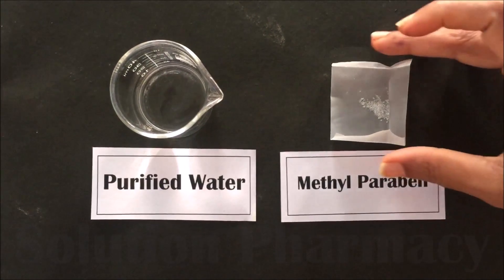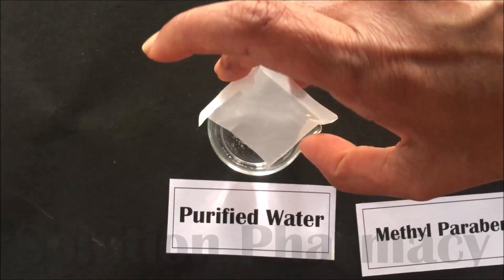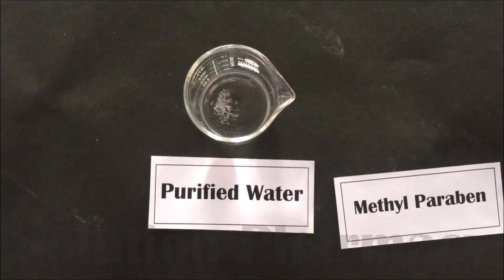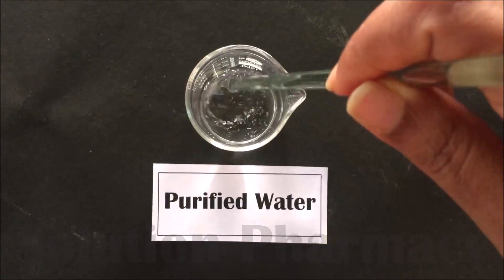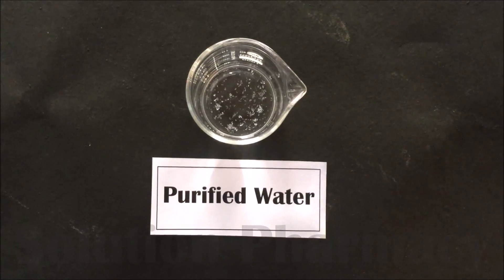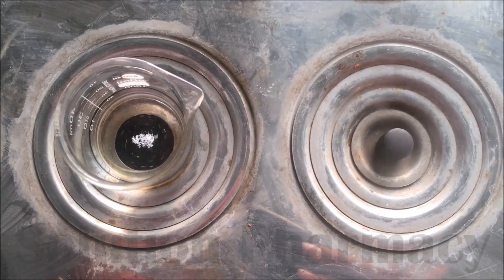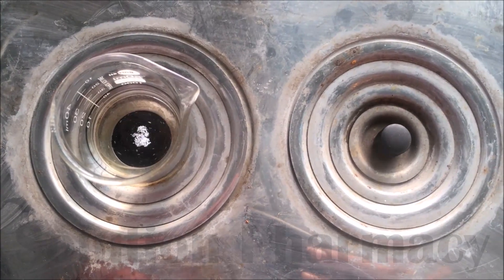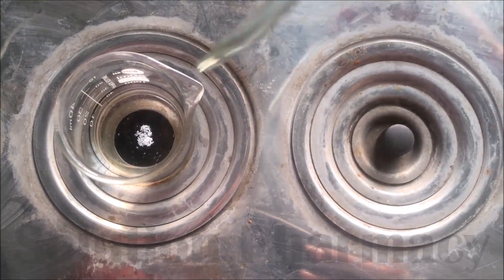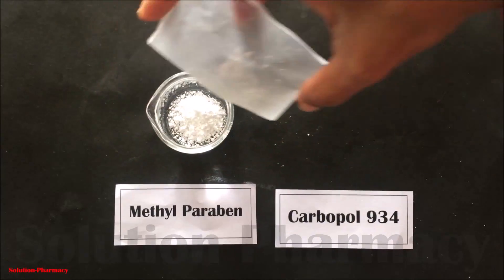At the same time, weigh 0.01 gram of methylparaben and transfer it into a beaker containing 15 ml of water. Mix it properly with a glass rod, then heat the contents on a water bath to dissolve the methylparaben. Methylparaben is used as a preservative — it preserves or protects our preparation from microbial growth, slowing or preventing the growth of microorganisms. After few minutes, methylparaben will dissolve on heating; then keep it aside for cooling.